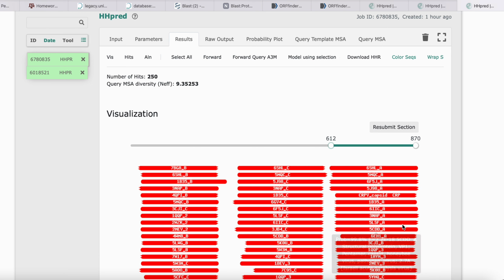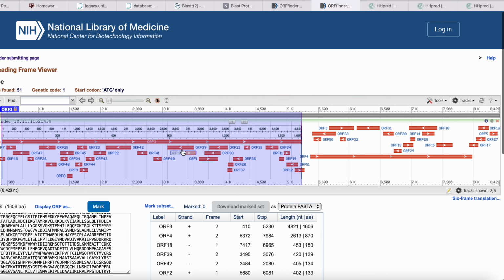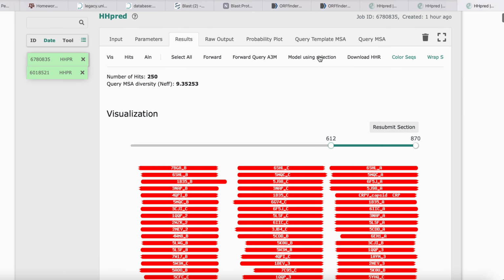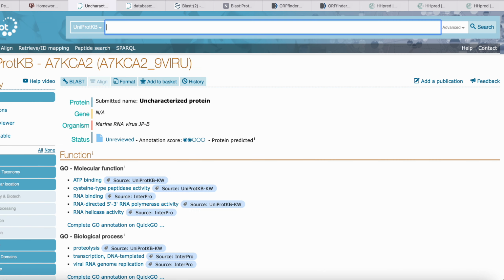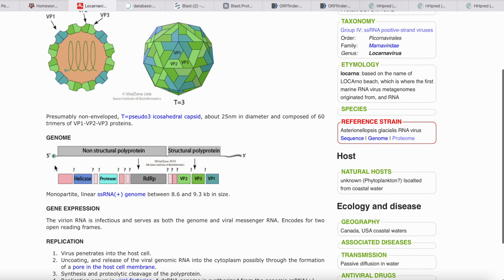And so then once you've got all that information, and you've got your ORF finder information, so this is where the proteins are and the direction they're in. This is what's inside those proteins, so this is in the big one, this is in the small one that I just showed you. Then you're going to make a map that's going to look like the map that we got over here. And you can do this with any program that can draw rectangles and make them colors. You can color it however the heck you like.